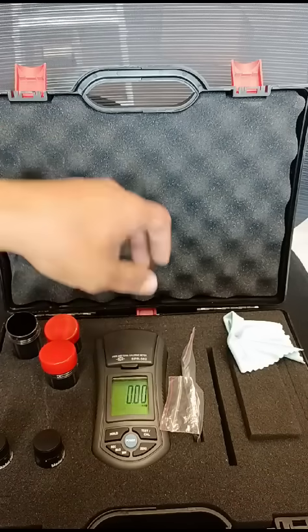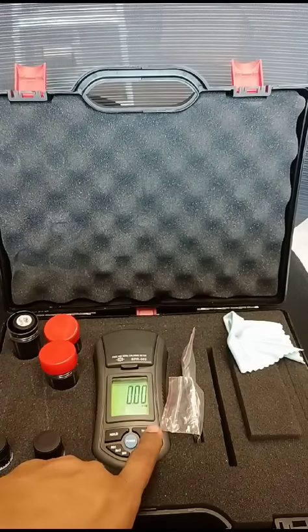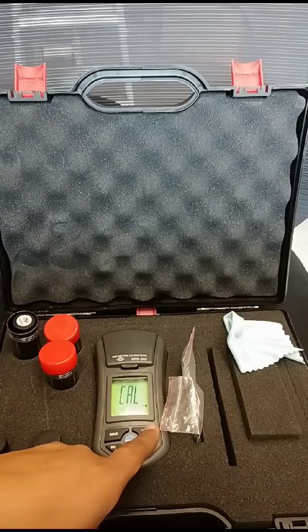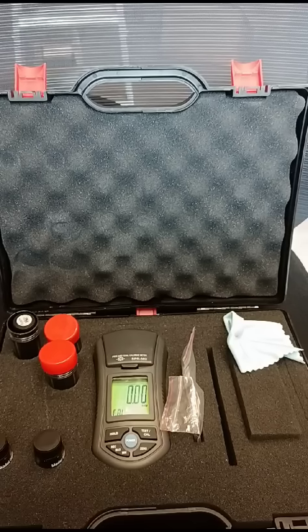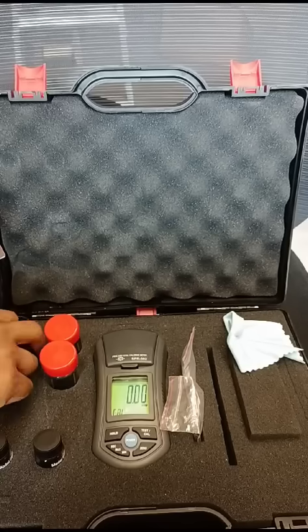Okay, now we have removed all non-zero values. You should make calibration for your device. Press and hold the calibration button for three seconds. Now you can leave it for five seconds — one, two, three, four, five seconds — and then press the calibration button once. Now you should put the zero standard solution in again.